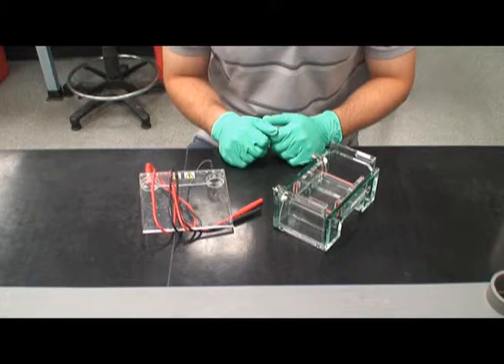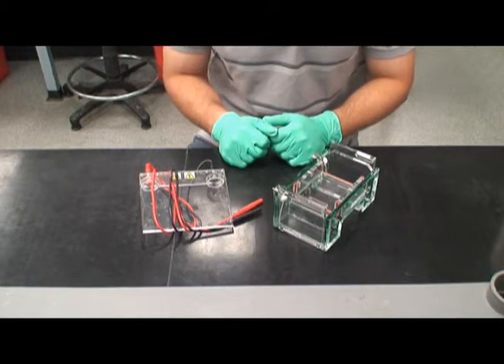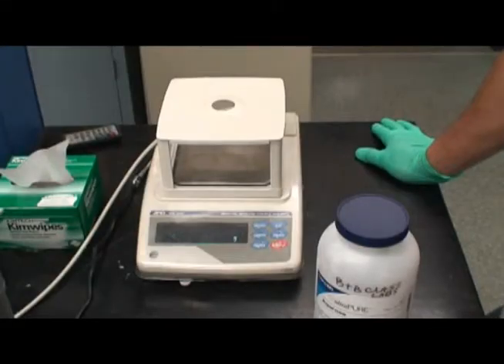A proper agarose gel contains 1% agarose. Therefore, 1 gram of agar is added to 100 milliliters of buffer TBE to make a correct ratio.